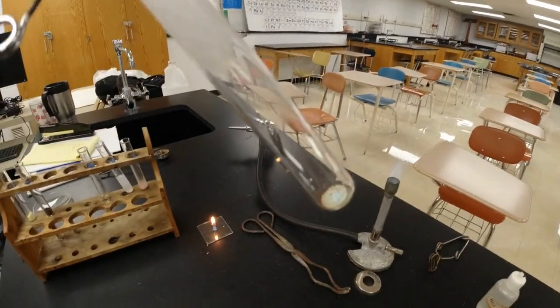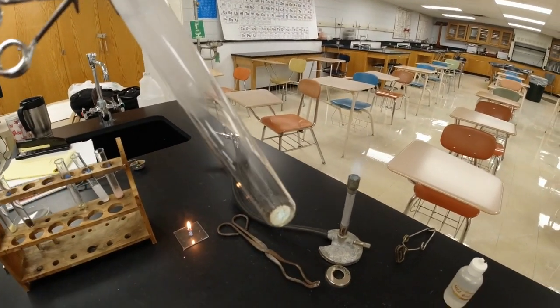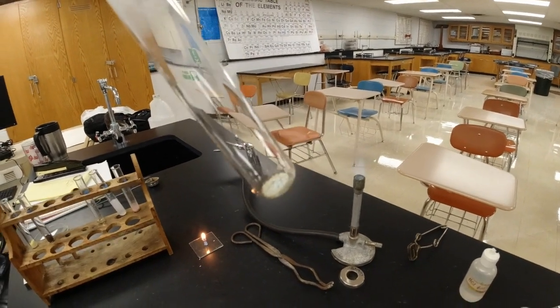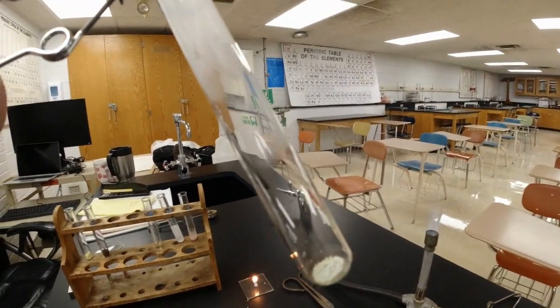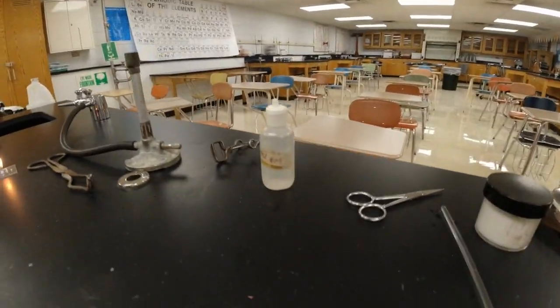All right, so it kind of turned brown around the edges. I didn't quite want that to happen, but it's a white color now. It's not blue like it was before. It's a white color. So I'm going to let this cool off for a few minutes here. We'll do something else with that.